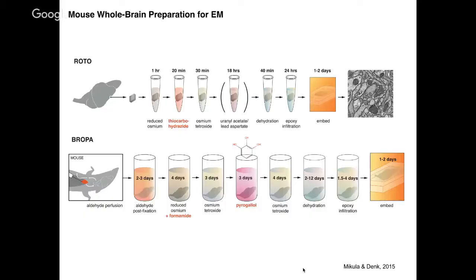It seems like it solubilizes things that would otherwise precipitate in solution and build up to form this diffusion barrier to further diffusion of the stain.